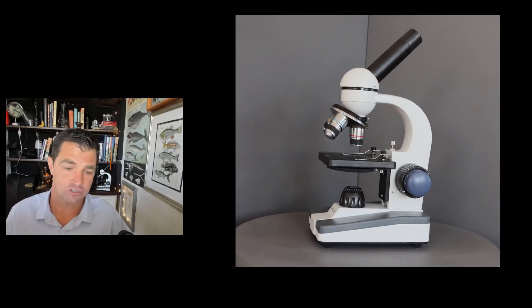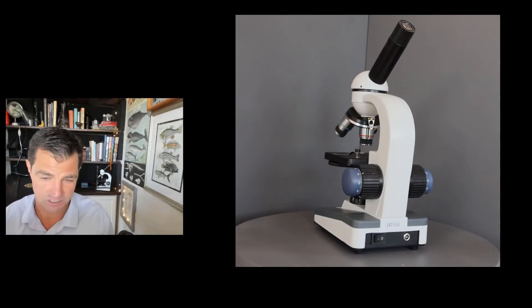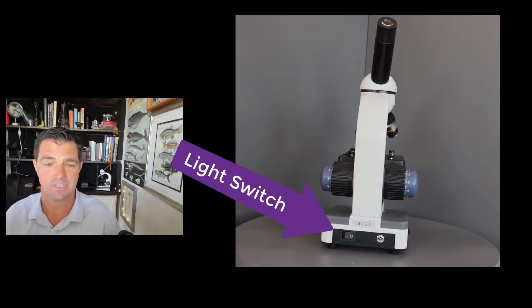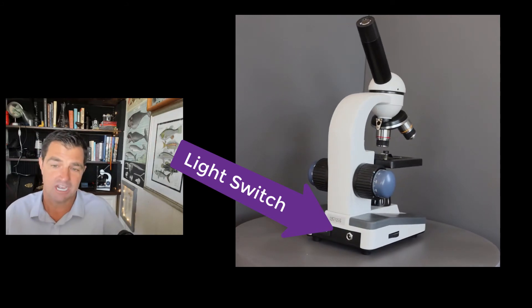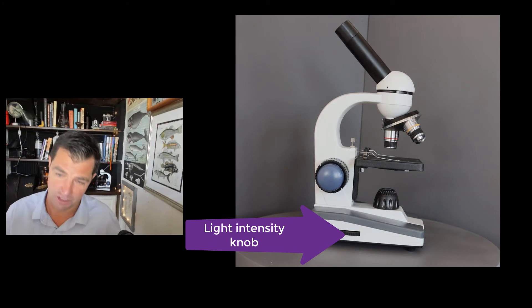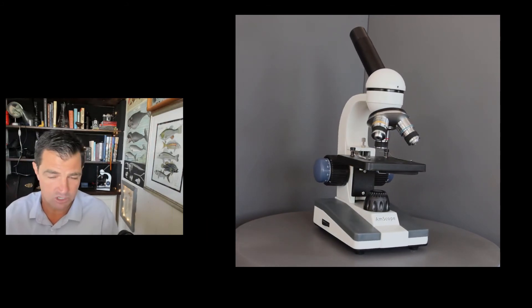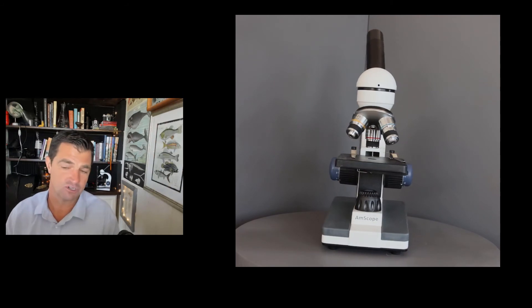The fine focus knob also moves the stage, but the movement is far less noticeable. If you turn it, you'll see. Finally, we have the light switch and the light intensity knob, and these are used to turn on the microscope and to adjust the amount of light that is passing through the slide you're looking at.